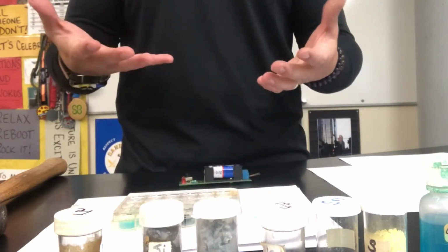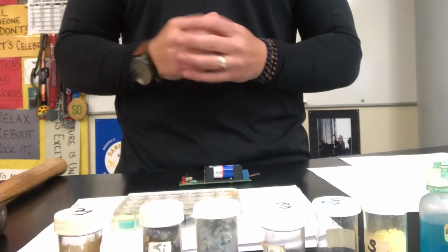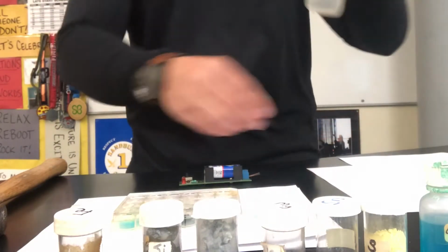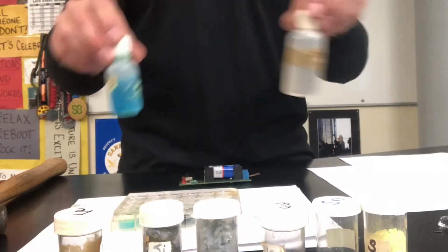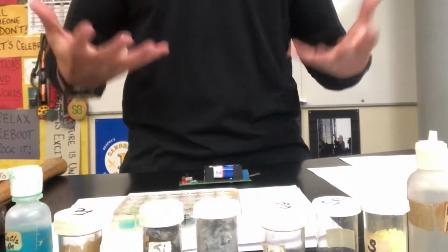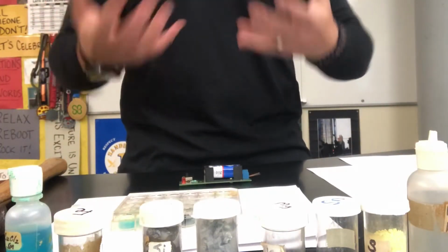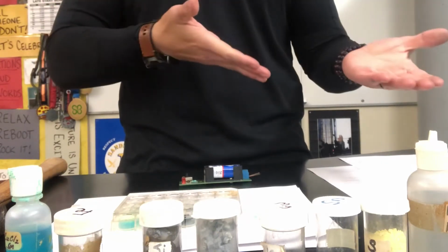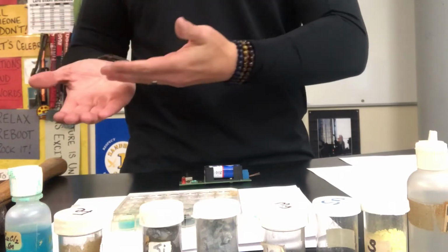We also tried to look into their reactivity, some of their chemical properties. Would they react with acid, and would they react with copper 2 chloride? So by doing that and filling out this data, you now have a better understanding after looking at the data of what metals tend to do and what nonmetals tend to do.